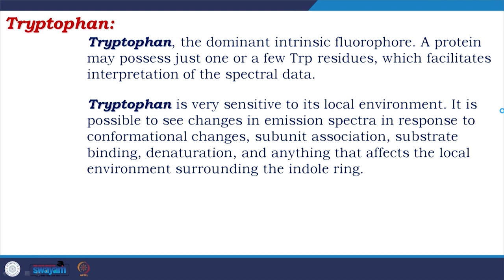Tryptophan is very sensitive to its local environment. It is possible to see changes in emission spectra in response to conformational changes, subunit association, substrate binding, denaturation, and anything that affects the local environment surrounding the indole ring. The indole ring is the reason for the fluorescence, but there is something else. What is that? See, tryptophan is quite a big molecule.